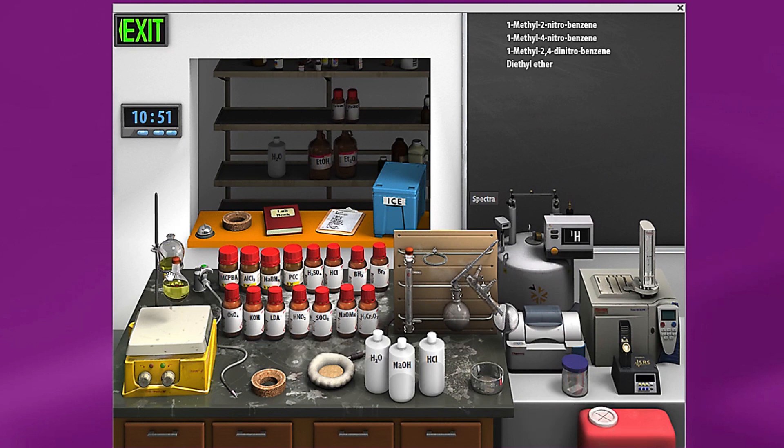Then you'll have the organic layer remaining. You can click on the organic layer to create a flask and drag it right here to your cork ring. And then drag your separatory funnel back to its spot.